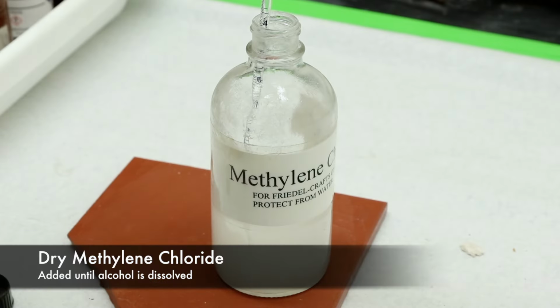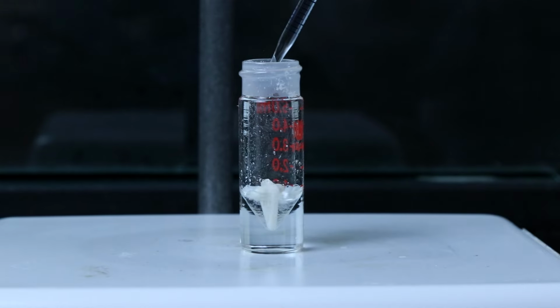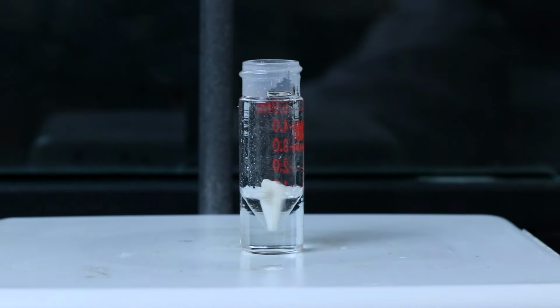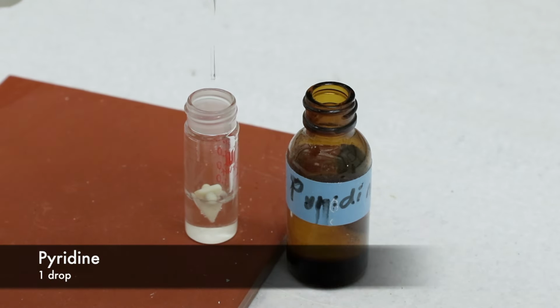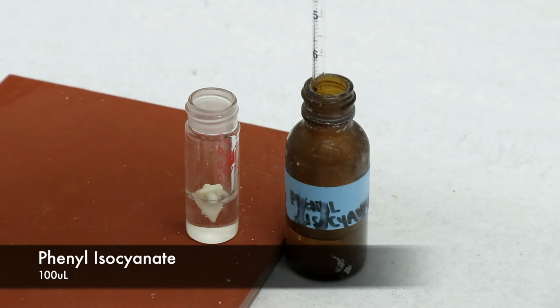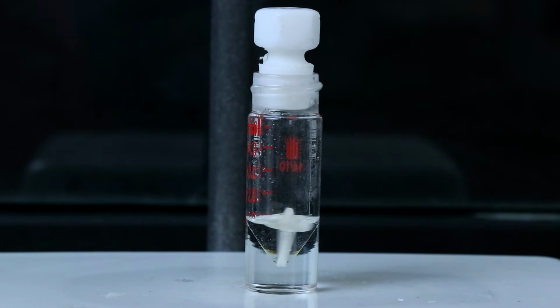I'll get some dry methylene chloride from the hood and add that until the solid is completely dissolved. And it shouldn't take any more than a milliliter. Once that's ready, I can add 1 drop of pyridine and then 100 microliters of phenyl isocyanate. Now I'll just cap the vial and let that react for an hour and a half.